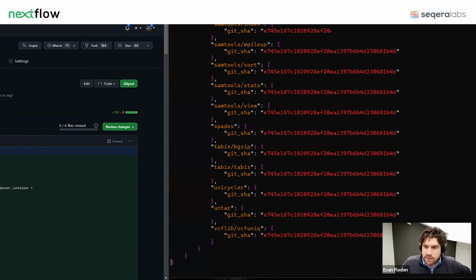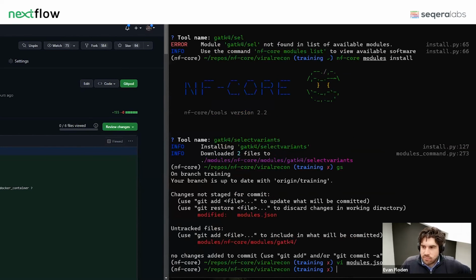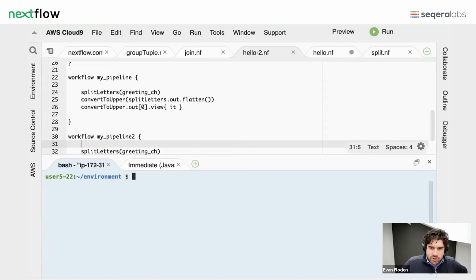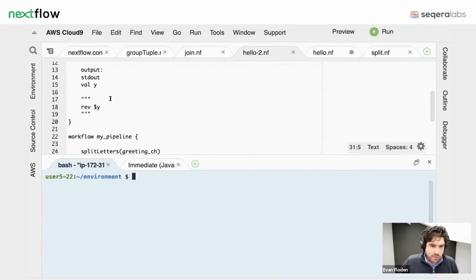Awesome, thanks a lot. Yeah, it shows a lot of what's possible in terms of building this out, and many different ways that you can arrange these things together. I wanted to show you before, I think I had an error. There's a question around how to resolve that. So basically, we have this way where we've included this process from this other file.